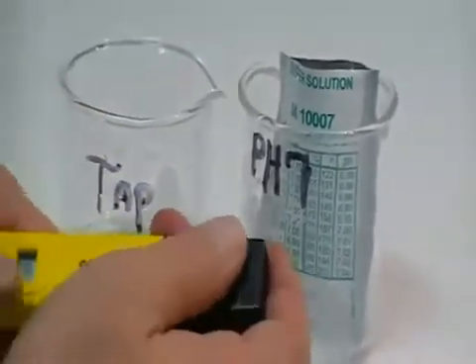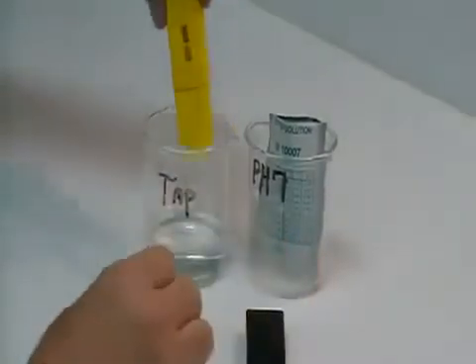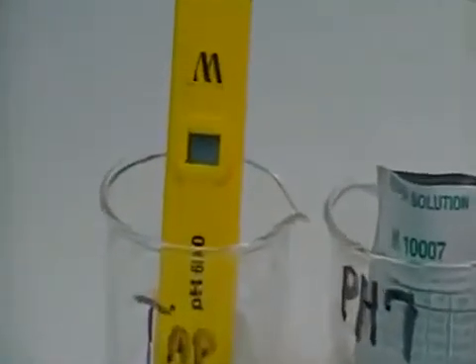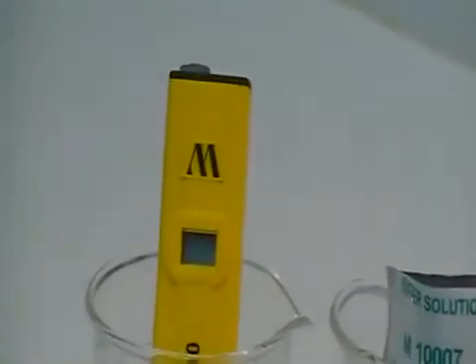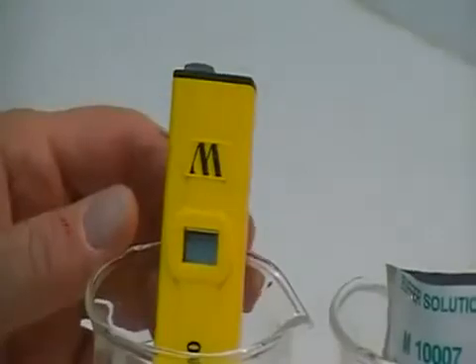Before we get started, the way we are going to proceed is: take the black cap off — and it is tight — so you remove the cap. This unit has already been pre-hydrated for about 30 or 45 minutes in tap water. You would go ahead and let it hydrate for that period of time.